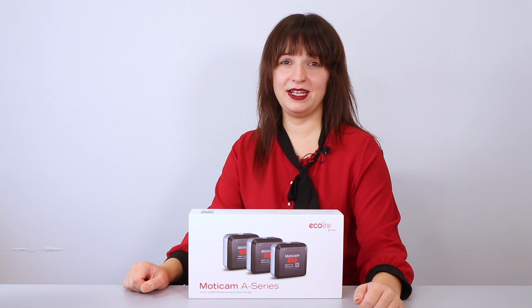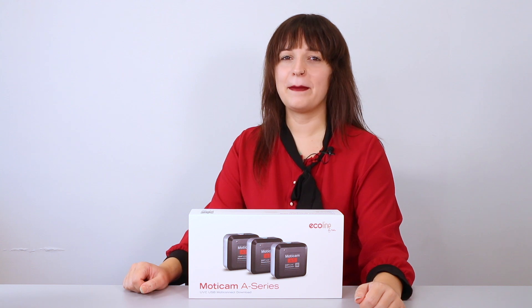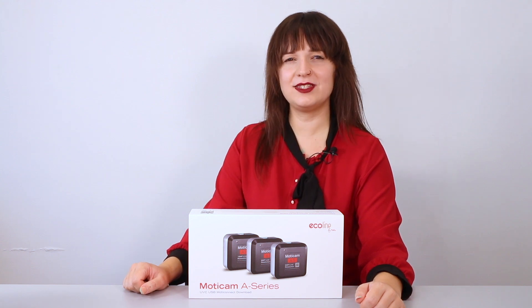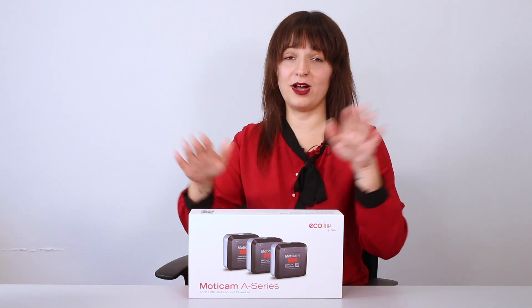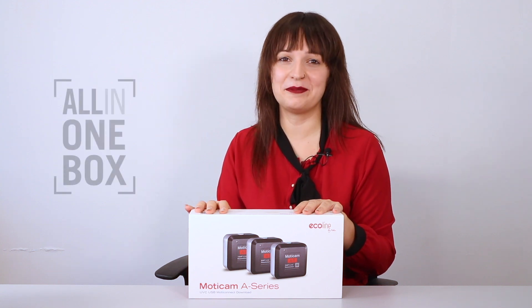If you're wondering what's included inside the box of our Moticam A-Series microscopy cameras, this is the video for you. My name is Chiara from Motic Europe, and today let's find out together what accessories are included and why we call this the all-in-one-box concept.